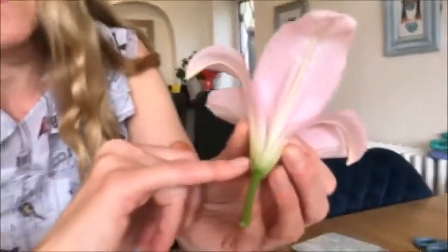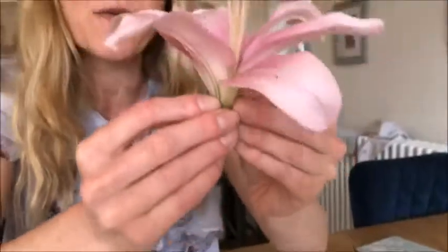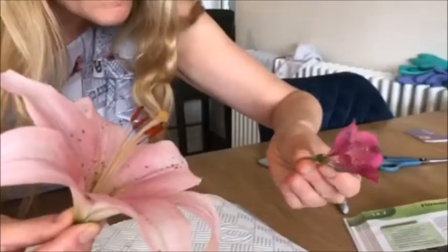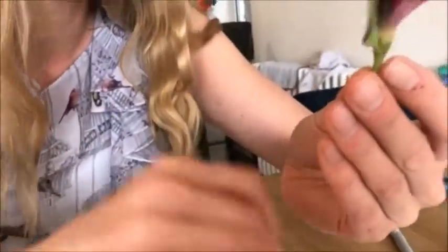Some flowers have, on the base here, a structure called a sepal, and that protects the flower when it's in bud. Don't know whether we can see the remains here of one. Not so obvious at all here.